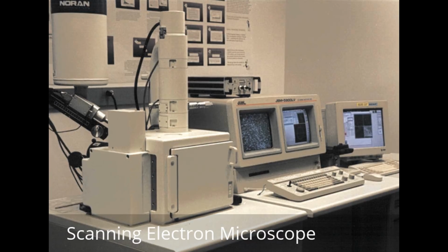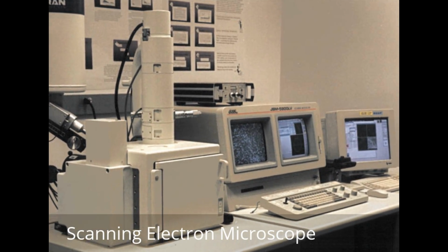The second kind of electron microscope that I've used is the SEM, which is a scanning electron microscope. The scanning electron microscope looks more at the surface of samples, like the valleys and the peaks, the surface of pretty much anything. And that's one part of electron microscopy, which is the observation of it.